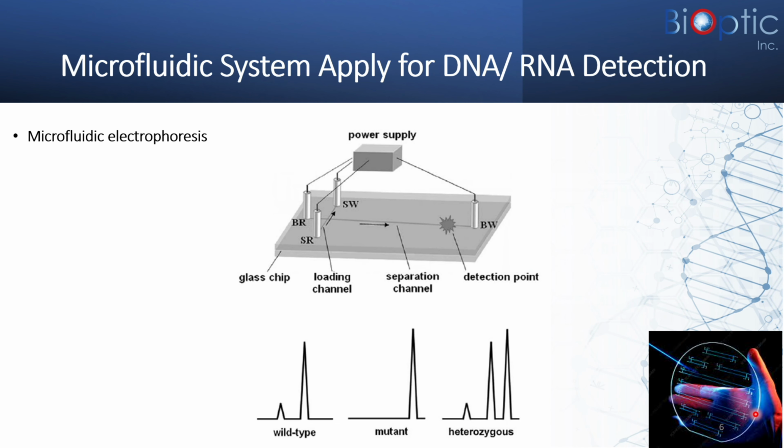In recent years, there is another popular technology, microfluidic chip. It narrows down the long capillary into a small chip to minimize the sample requirement and decrease the analytic time severely. However, the cost of consumables is very high.